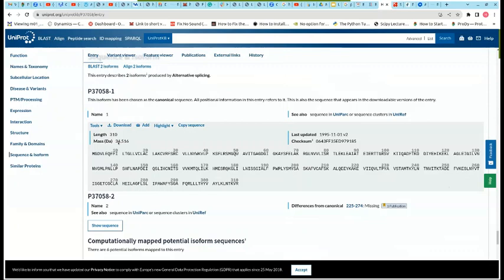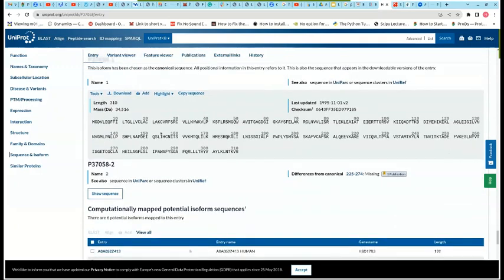So if you can see my screen, at this page, I already have the FASTA sequence. So I'm going to click on download. So once you download, it's going to bring you to this page where you have the amino acid sequence. So you just copy, just as you did in the previous lecture. You could either copy it and place it on MS Word or a text editor.